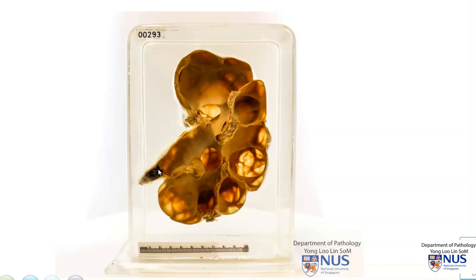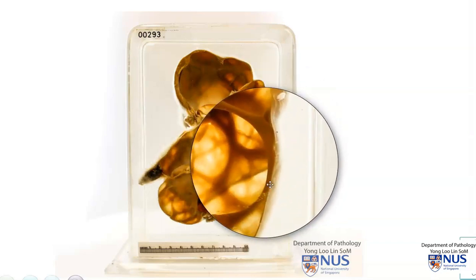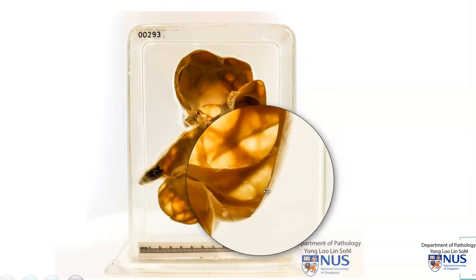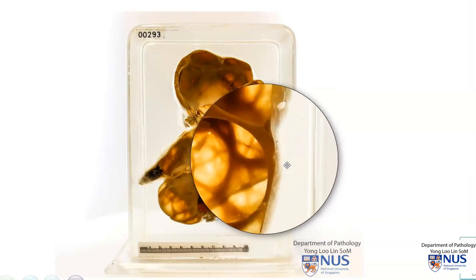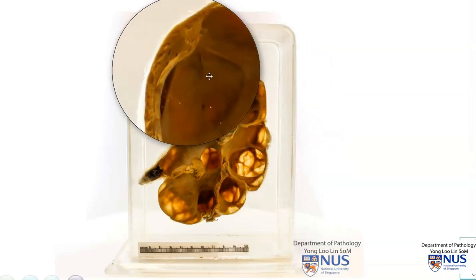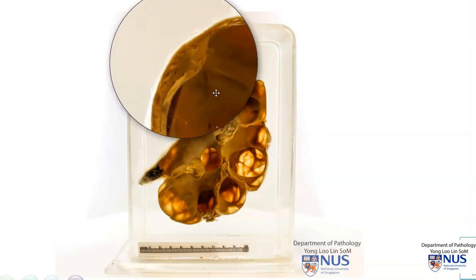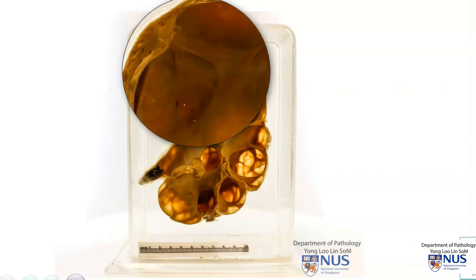And this goes down to the proximal ureter. And actually the third abnormality is the fact that the renal parenchyma itself, the cortex and medulla, is markedly thinned and atrophic. Just to show you how thin the renal parenchyma is, in some areas it is almost as thin as 1 millimeter, and we can't really readily appreciate the corticomedullary junction where the cortex stops and the renal medulla starts because of the severe parenchymal atrophy.